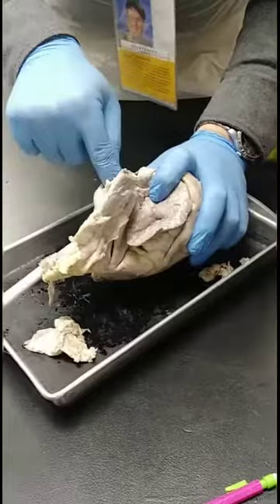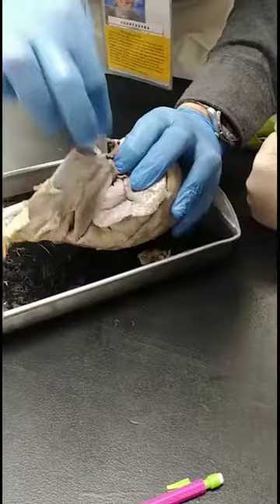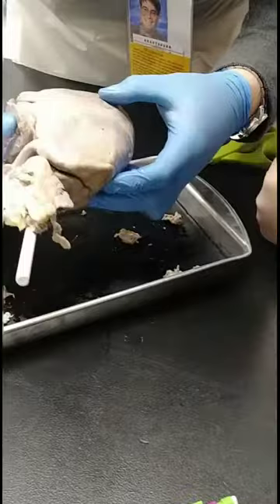Here's one of your probes. See how thin it is? Let's mark that and just explore it now. This is the atrium right here, or it looks like.